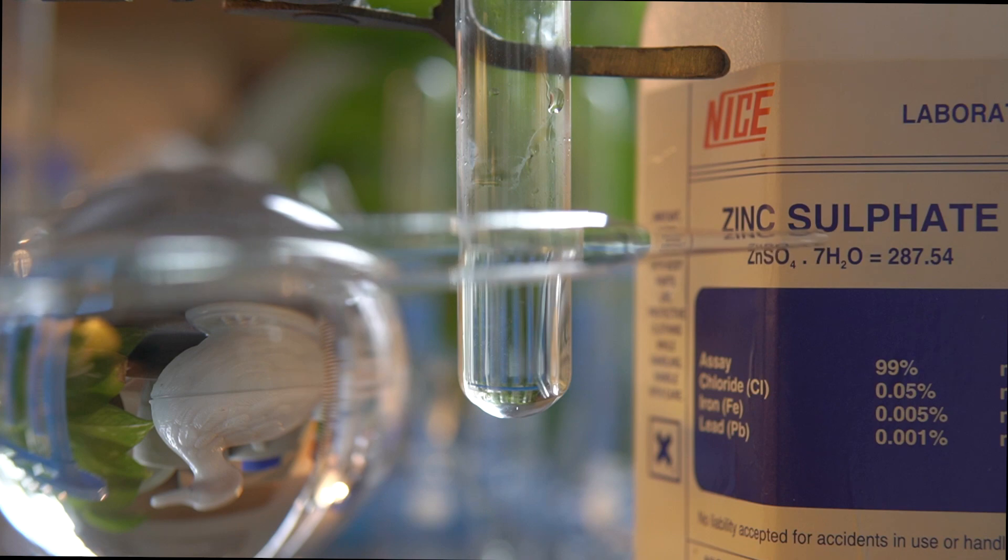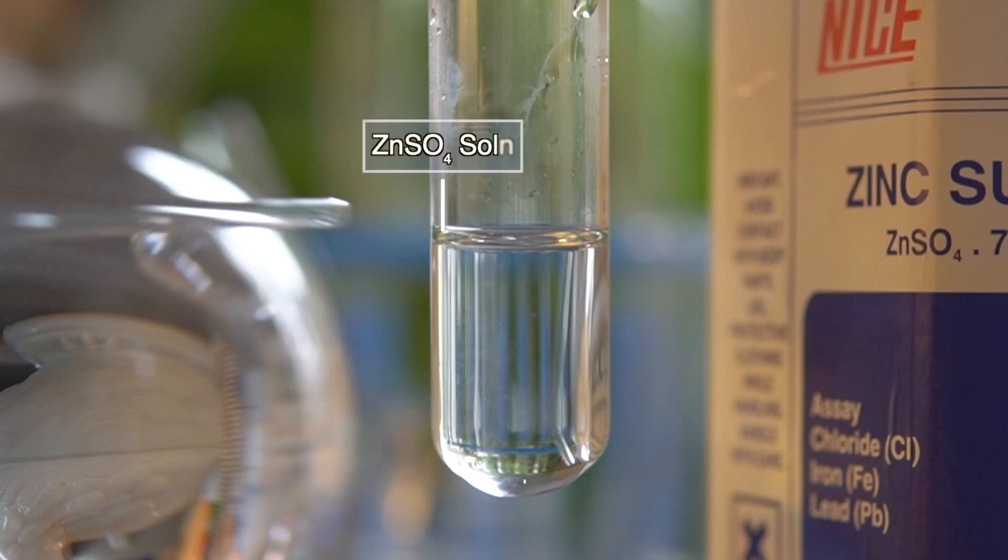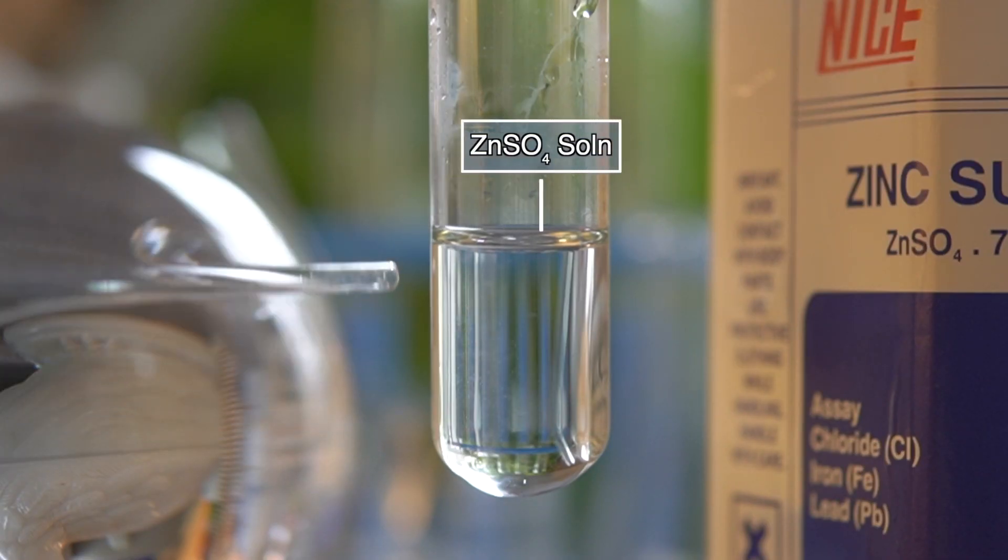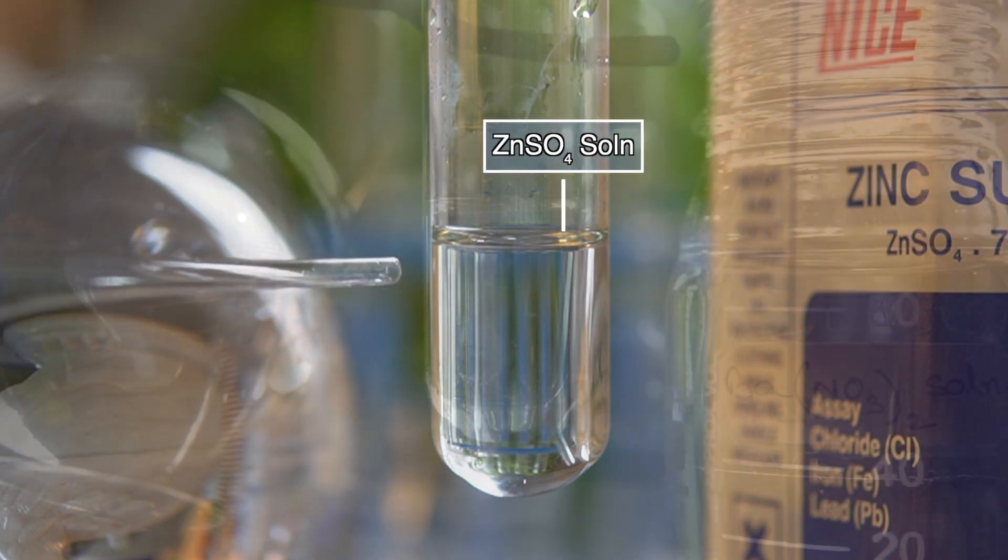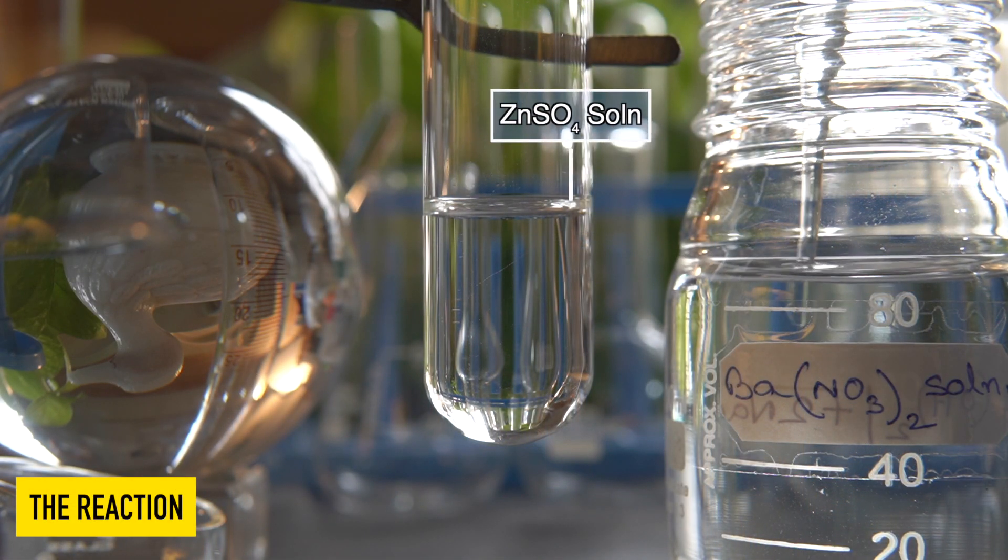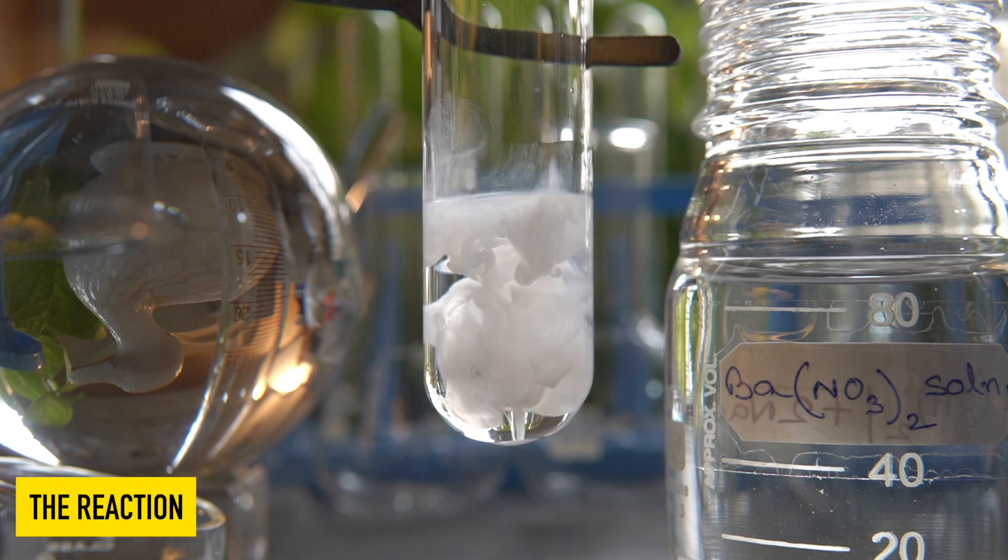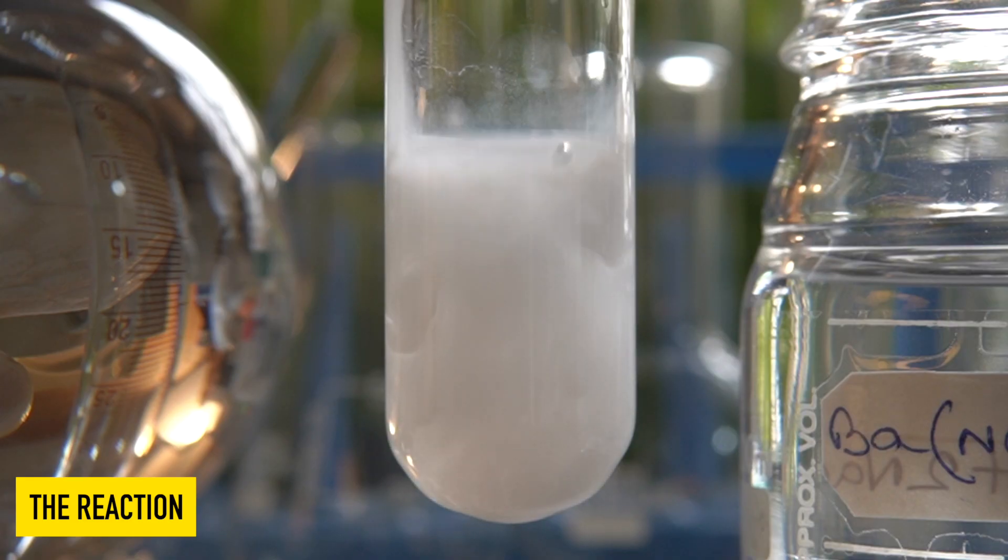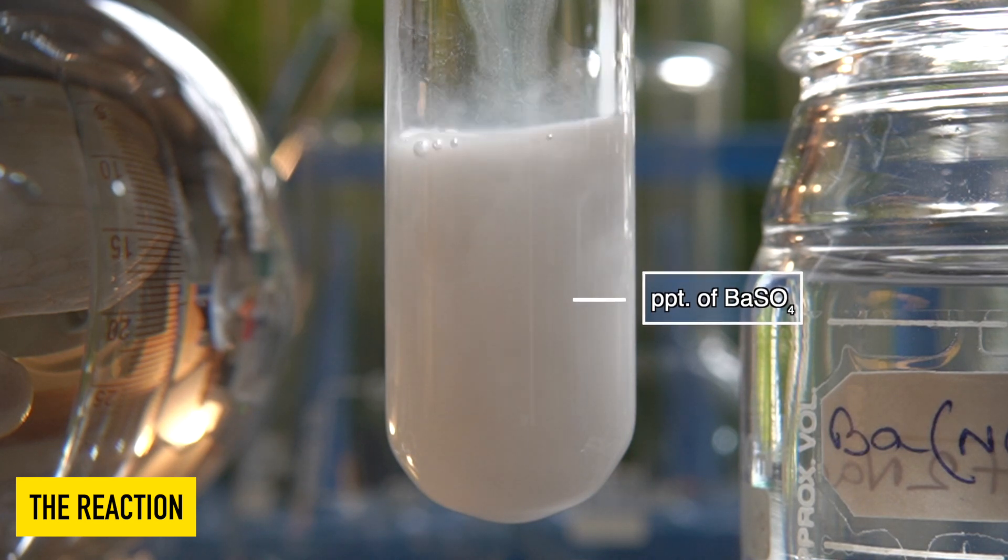To initiate the chemical reaction we will take some clear solution of zinc sulfate into this test tube. Now we will add barium nitrate solution slowly into the zinc sulfate solution dropwise and observe the effects.